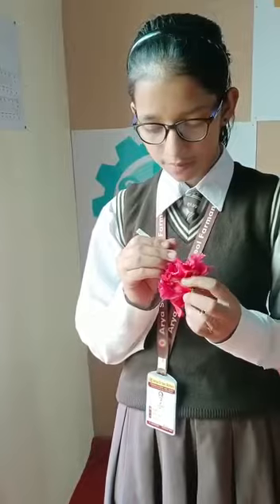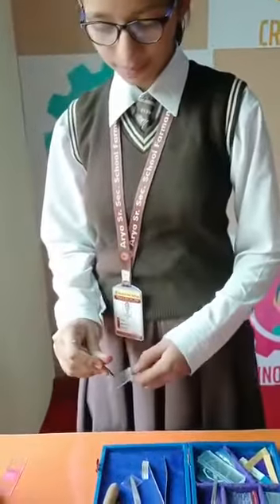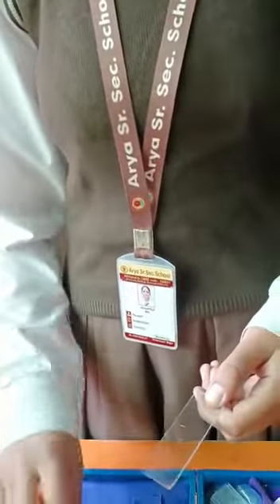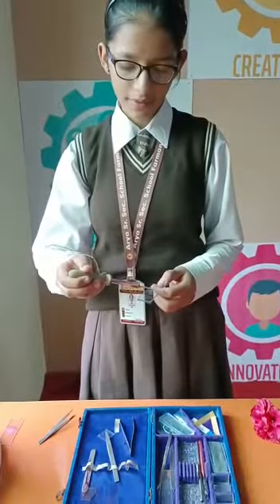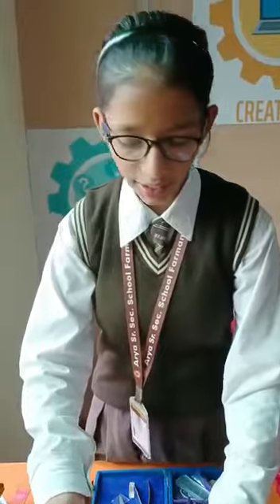This is a hibiscus flower. Remove its carpal and put it on a glass slide. Now add few drops of distilled water. Wash it thoroughly and now remove the excess water.